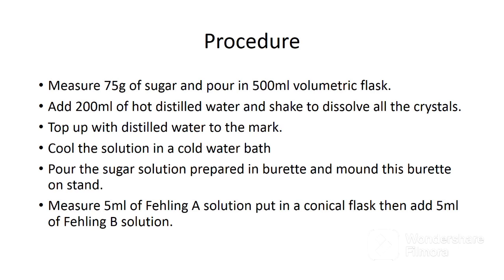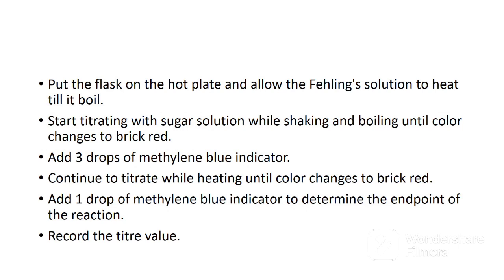Measure 75 grams of sugar and pour into a 500 ml volumetric flask. Add 200 ml of hot distilled water and shake to dissolve all the crystals. After dissolving, top up to the mark with distilled water and cool the solution in a cold water bath. Pour the sugar solution into a burette and mount the burette on the stand. Measure 5 ml of Fehling Solution A and 5 ml of Fehling Solution B into a conical flask. Place the conical flask on the hot plate and allow the Fehling solution to heat until it boils. Start titrating with the sugar solution while shaking and boiling until the color changes to brick red.